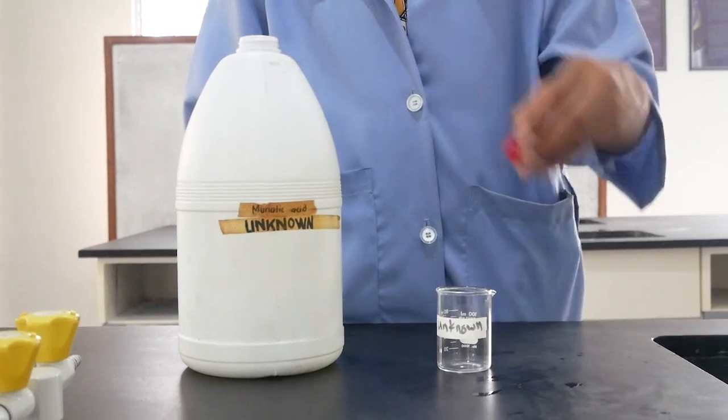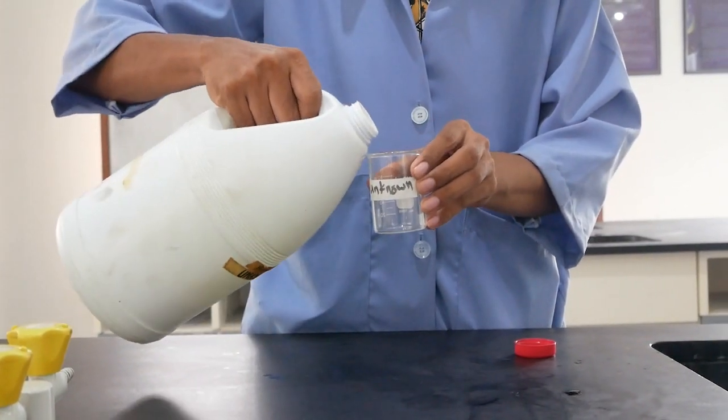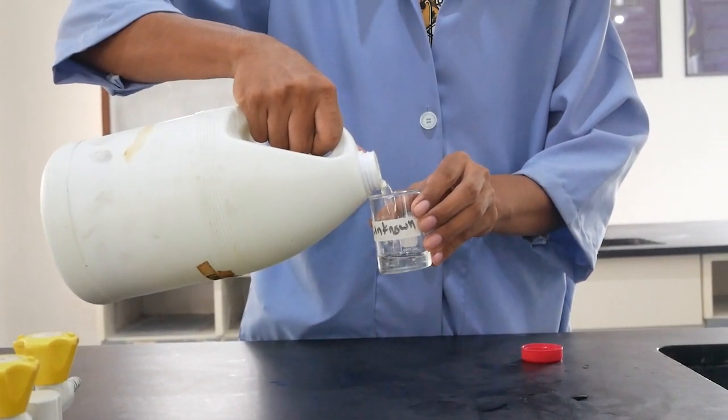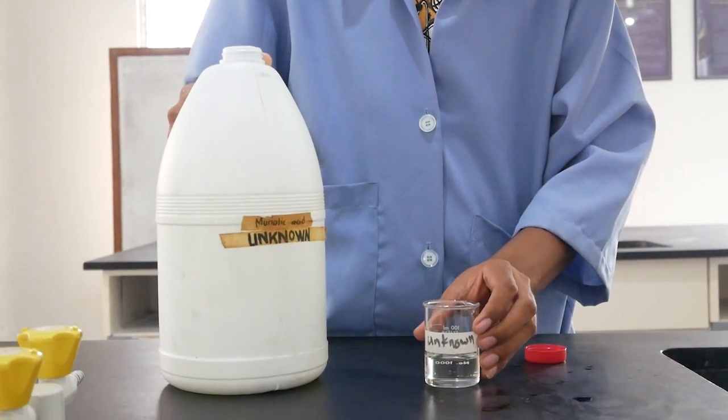Take the hydrochloric acid solution, whose concentration we do not know yet, and pour some of it into a small beaker. This is to be diluted further before it can be used as our analyte.